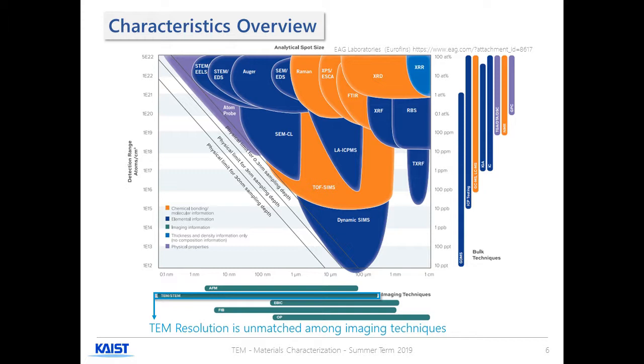When compared to other characterization techniques, and most particularly to other imaging techniques, TEM's resolution is unmatched, making it particularly adapted to material characterization at the nanoscale.